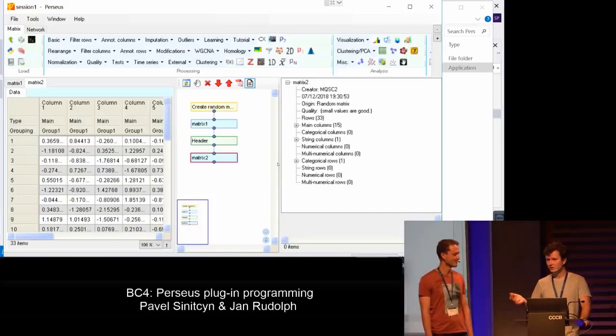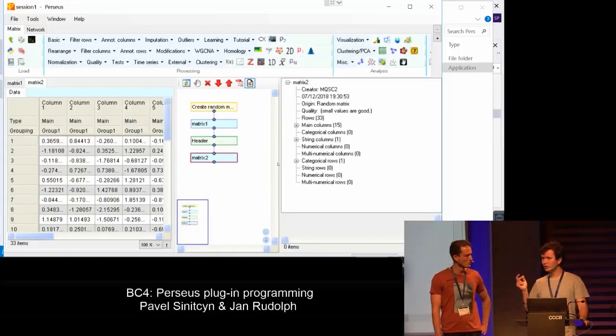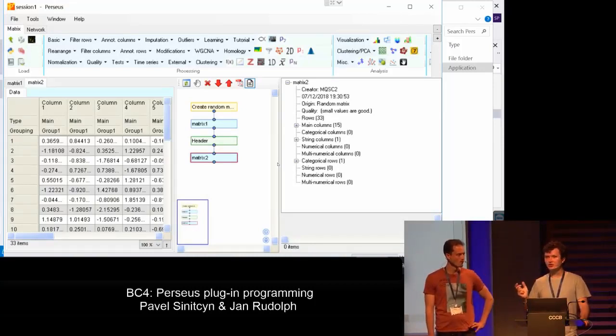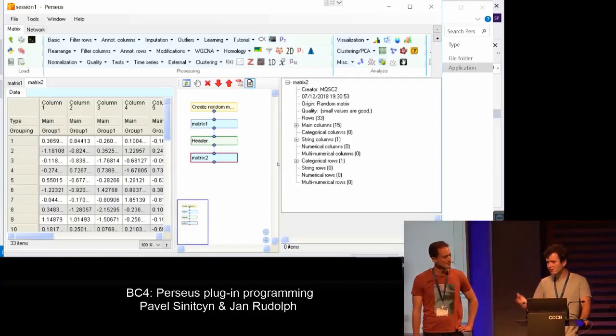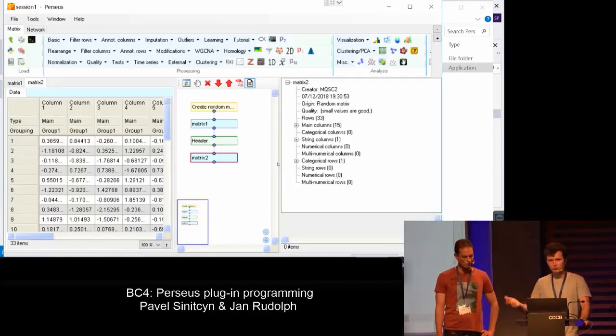It's even using C#. It's not so complex a task. Second thing, if you want to make some plugin, just use code which is doing pretty similar things to what you want to do.